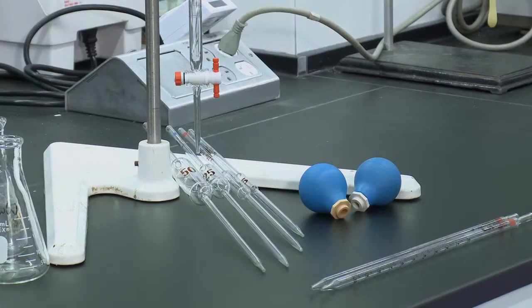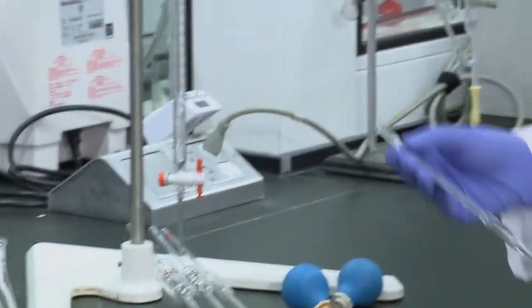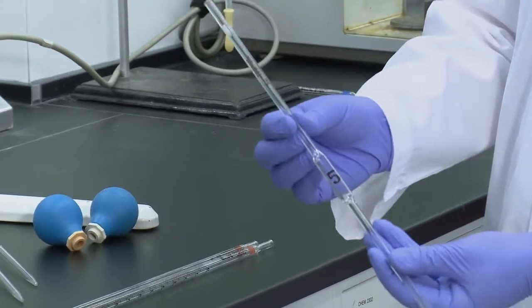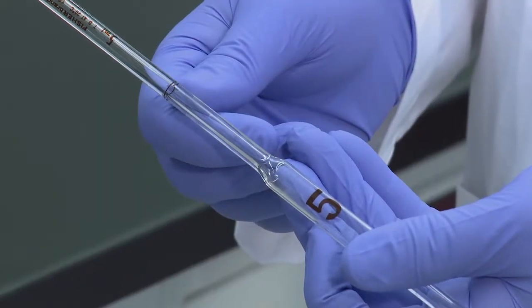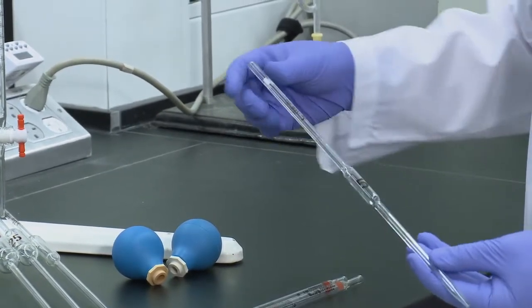There's several different ways we transfer accurate volumes in this lab. Most commonly you'll want to use your transfer pipettes which have the indicated volume on them and a single line like the volumetric flasks. These are the most accurate means you have to transfer volumes in this lab.